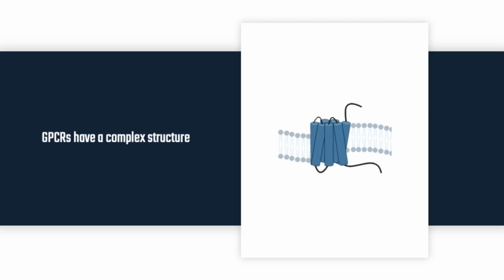function. Once again, working with immobilization-based technology will require the need to find suitable conditions to immobilize, but not only to immobilize, also to regenerate the protein of interest on a surface. And that should be done without altering or hindering the conformation of these helices and the loops, which are the main binding sites. The immobilization and regeneration conditions are often well optimized for secreted proteins, but the combination of hydrophobic and hydrophilic moieties of a GPCR protein makes the immobilization and regeneration processes of GPCR more challenging. And it is sometimes very complicated to maintain their structural integrity.